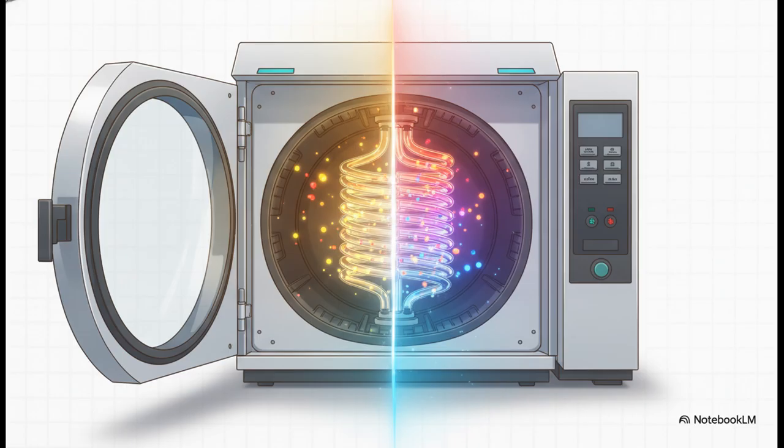But our apple extract is a wild, unpredictable mix. Some compounds boil super easily, while others need intense, heavy heat. If we keep the temperature low, those heavy chemicals will literally take hours to exit. If we start high, the light chemicals will all fly out at once in a completely unreadable clump. The game-changing solution here is temperature-programmed analysis. We start it cool to gently tease apart the highly volatile compounds, and then we slowly, methodically ramp up the heat. This gently coaxes out the heavier, stubborn compounds without wasting precious hours in the lab.